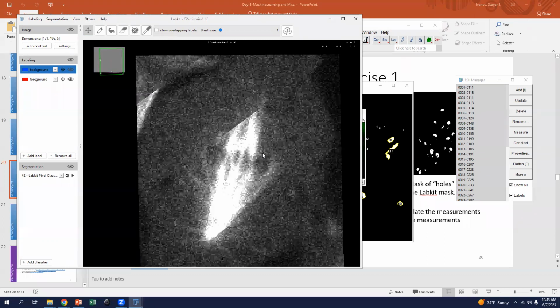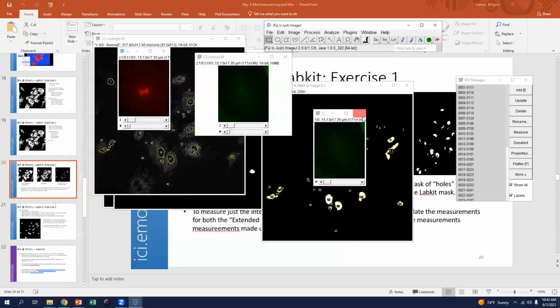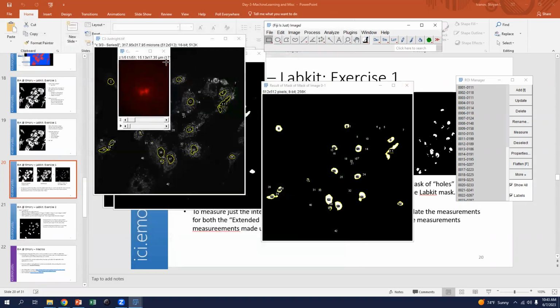So it does bring in the slices, but that's something I'm gonna need to do a bit more research on. I'll need to get back to you. Oh, I mean, the way Tomas was doing it seemed straightforward.